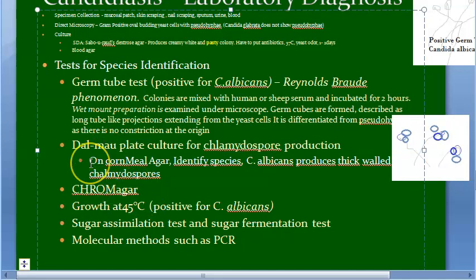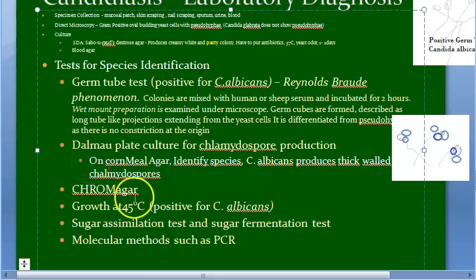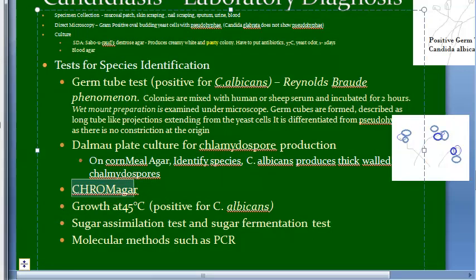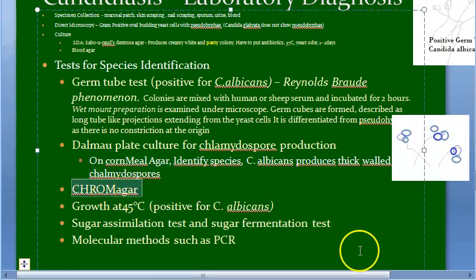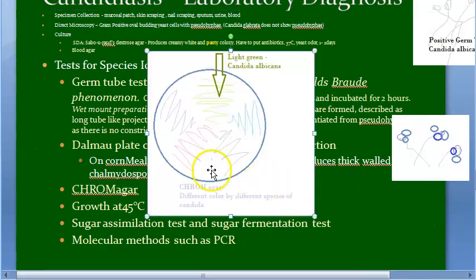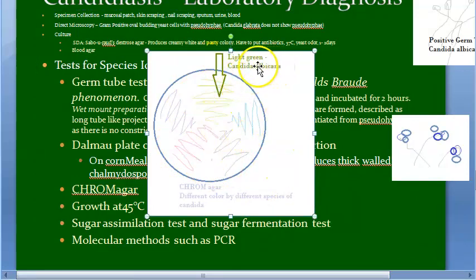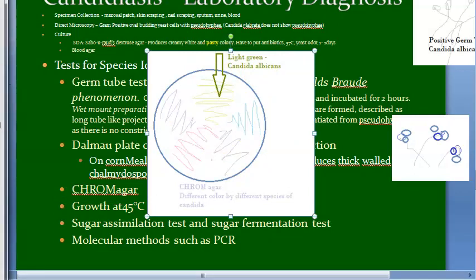Next is Chrome agar. On Chrome agar, different species of Candida produce different colors. Candida albicans produces a light green color on Chrome agar. That is the key point about Chrome agar — different Candida species produce different colored colonies.